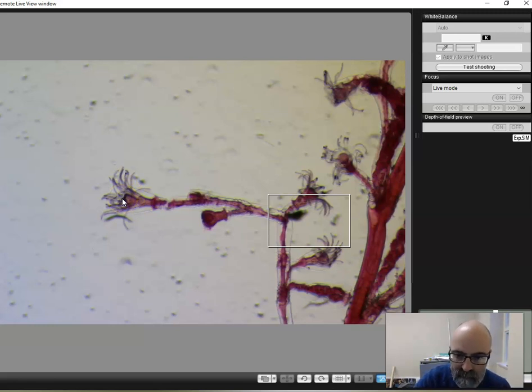Okay, so we see basically it's very similar to a medusa jellyfish. If you break this off, flip it upside down, we'll see the tentacles on the bottom. The mouth would be down here, right? So the gastrovascular cavity. I'll zoom in right here.